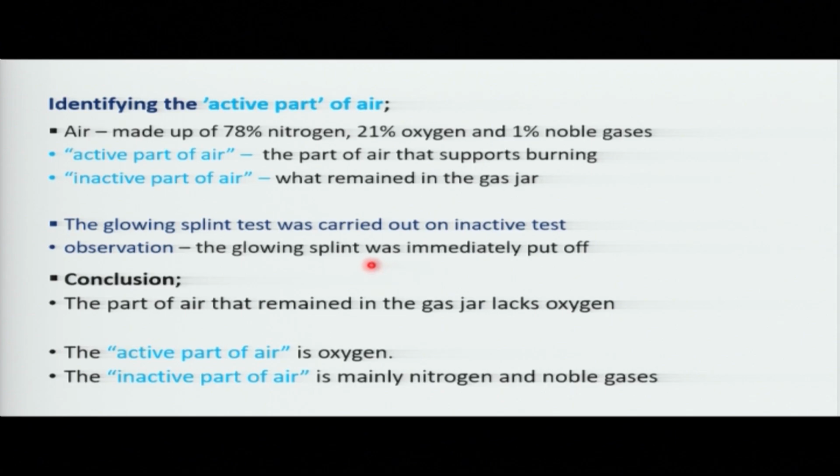because when we tested the inactive part of air after the candle had gone off, we found that the glowing splint was not rekindled. As such, we do not have oxygen in the inactive part of air after the candle has gone off. That confirms that oxygen is the active part of air that supports burning. And even the test showed it: when you have oxygen and you bring in a glowing splint, it will be rekindled. But without oxygen, there will be no rekindling. So that is it with testing oxygen and the physical and chemical properties of oxygen.